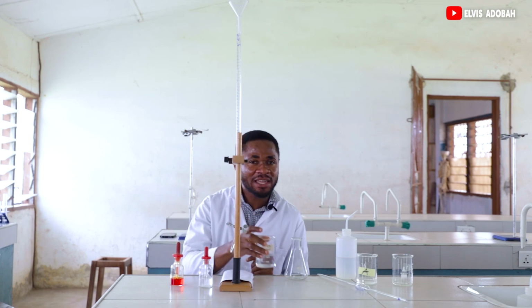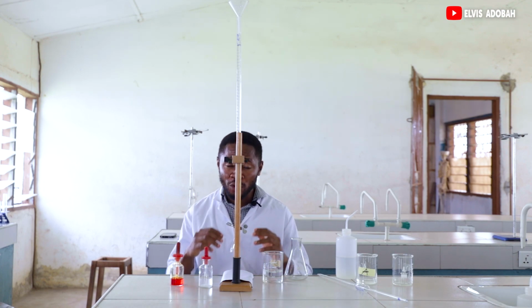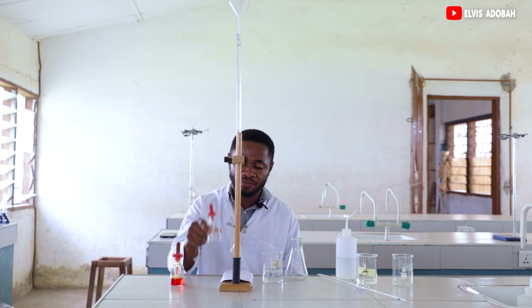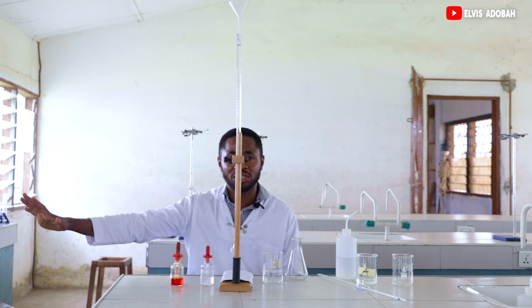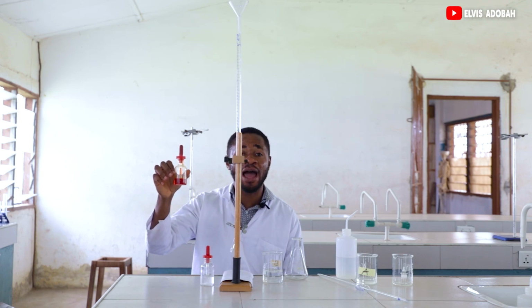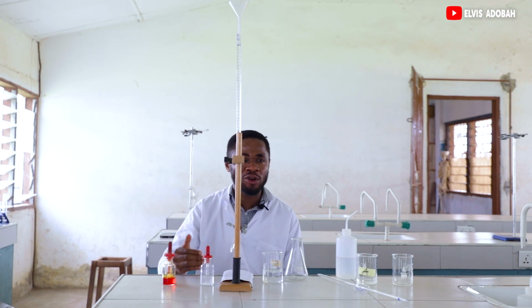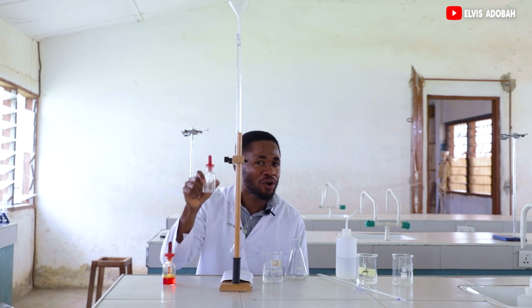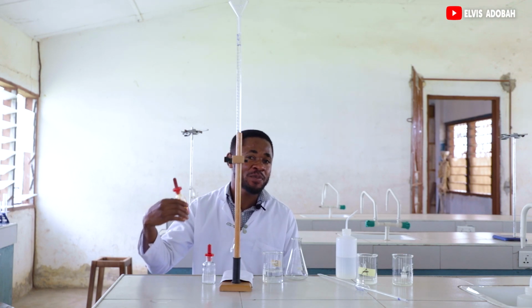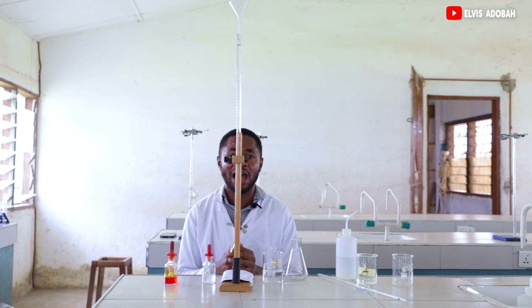But the difference is that here, we won't continue the titration. In fact, we are going to perform two separate titrations. The first one with phenolphthalein indicator. When we are done, we are going to discard the solution, pipette another portion of the solution B, and this time we are going to add methyl orange. That is the discontinuous. So we are not continuing with the titration with the phenolphthalein. No, we are going to perform a different one with the methyl orange. Hence the name discontinuous. Let's delve into it and see how it is performed.